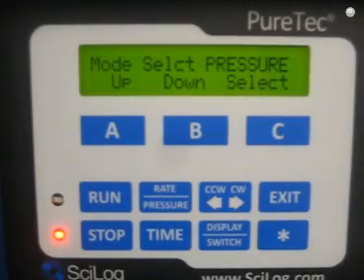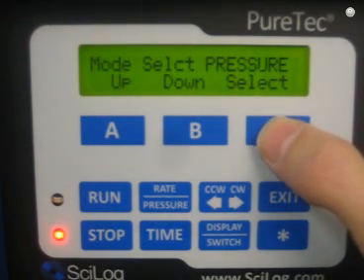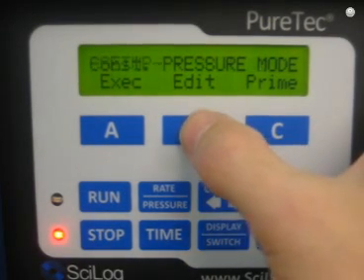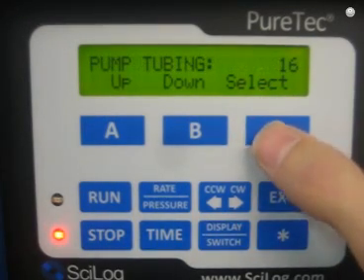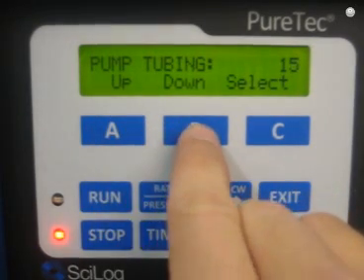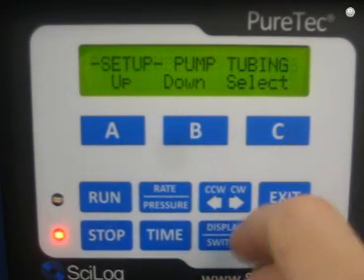Setting up your TFF run is really just a matter of setting a few parameters within one of the several menus. Let's take a look at an example of changing a parameter, because if you can change one parameter, you can change all of them. I'm going to go into the constant pressure mode and change the tubing size. Right now we're using number 16 tubing from MasterFlex. I'll hit Select, then Edit. This allows me to change the pump tubing. I hit the Select button and there are several different tubing sizes — 17, 18, 15 — and in this case the default is 16. I'm going to choose 16 and hit Select. That's how you change a parameter.